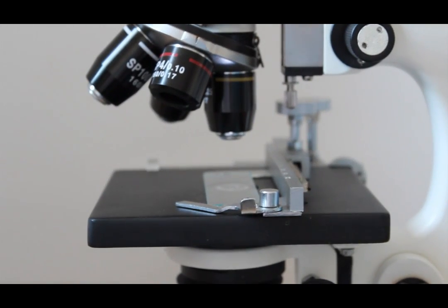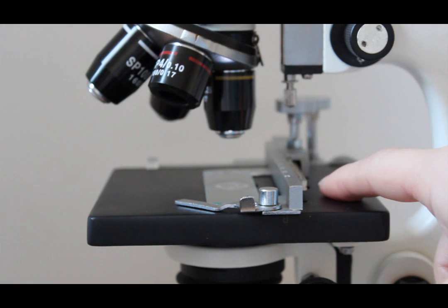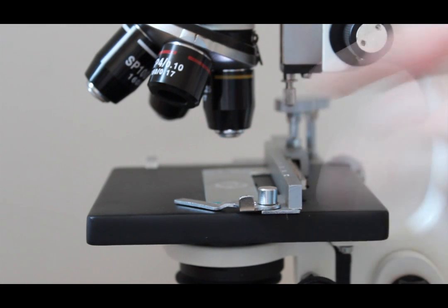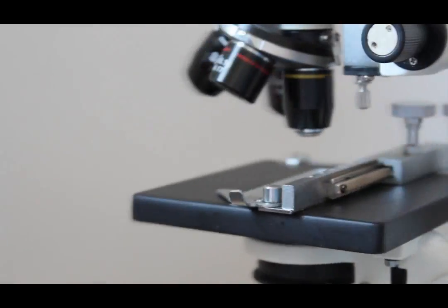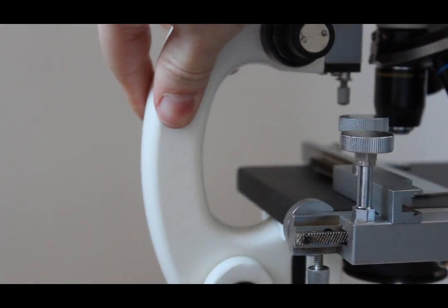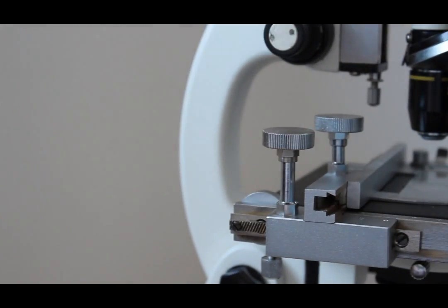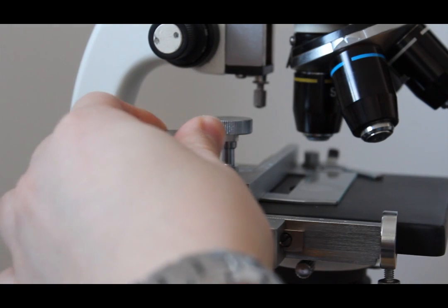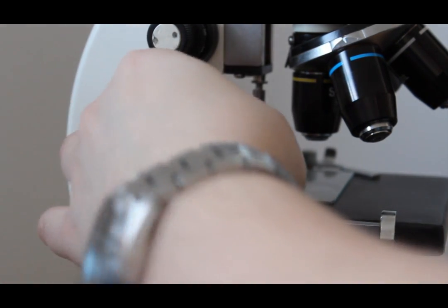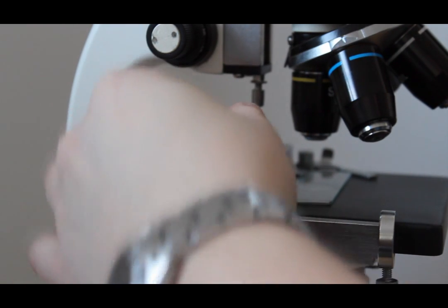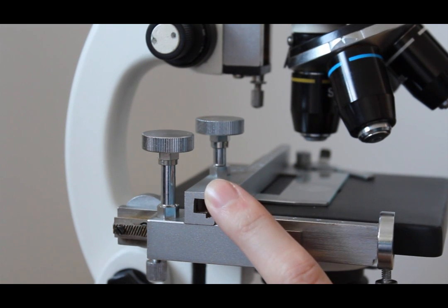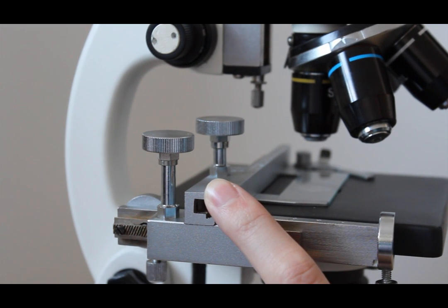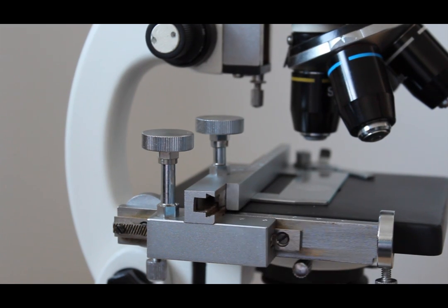The next thing I want to look at is the actual stage. So this whole thing is basically called the stage. This is where your slide or the specimen you want to look at is going to go. So on the stage you're going to have, I'll show you, your Y and your X axis here. So you can move it around and see exactly what you want to see and where you want to see it. This here is basically just part of the mechanical stage.